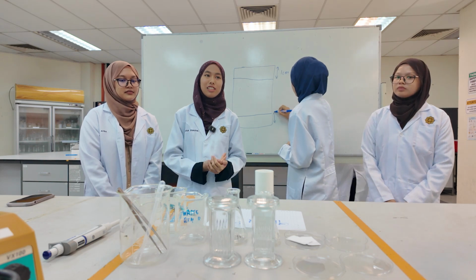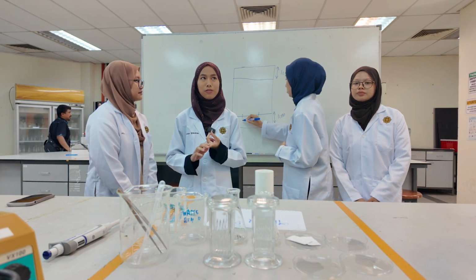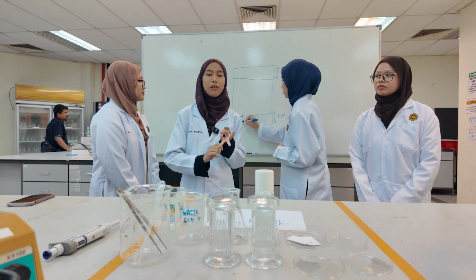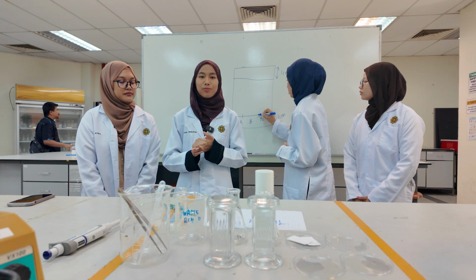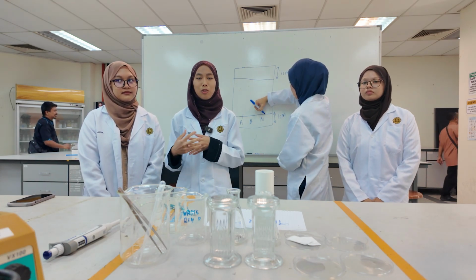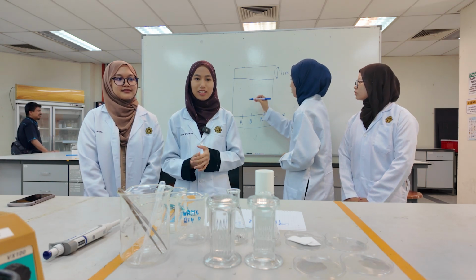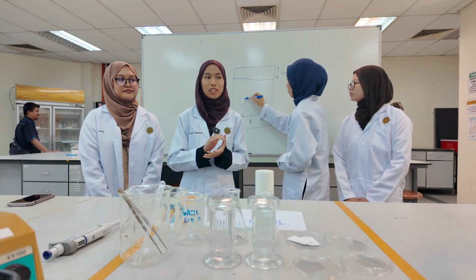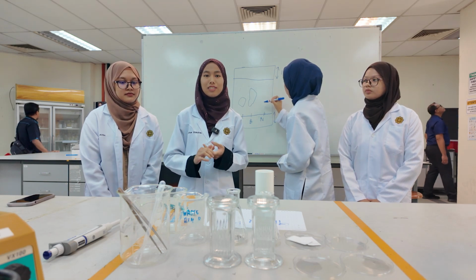So what is TLC? TLC, or thin layer chromatography, is a rapid, simple and cost-effective technique used in organic chemistry. It helps to separate and identify compounds in a mixture by utilizing the differences in how a substance interacts with the mobile phase and stationary phase.